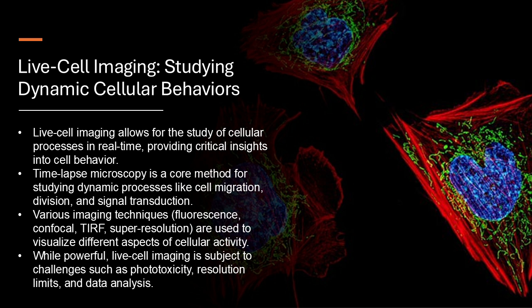Exactly. And that's not all. Live cell imaging experiments often generate massive amounts of data. Right, the data deluge. We're talking about terabytes of information that need to be processed, analyzed, and interpreted. This requires powerful computers and sophisticated software, not to mention skilled researchers who can make sense of it all. It sounds like big data meets biology. It does. But despite these challenges, the future of live cell imaging seems incredibly bright.